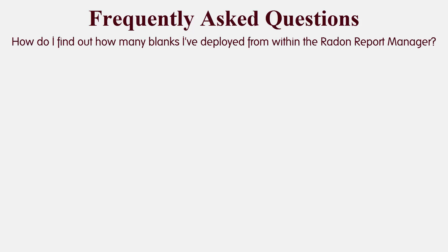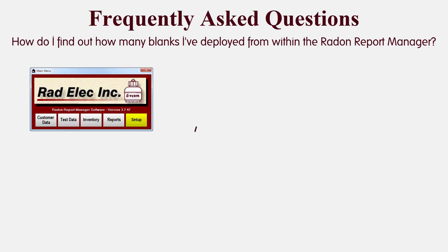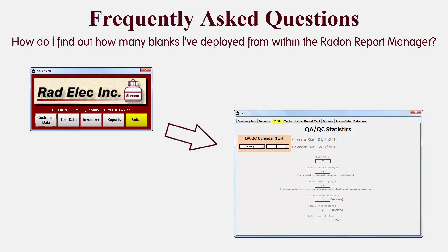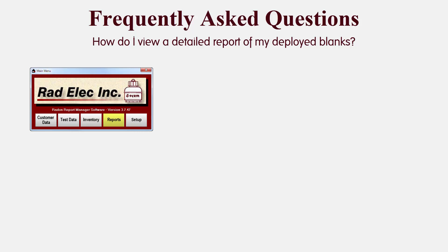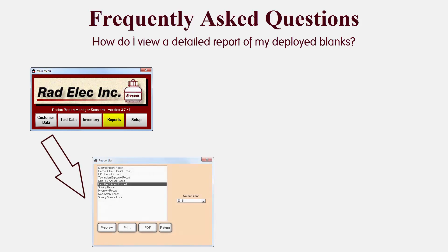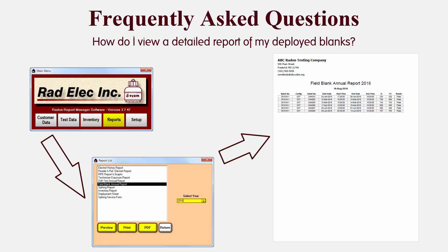How do I find out how many blanks I've deployed from within the Radon Report Manager? To see how many blanks you've deployed, go to the main menu and click on the Setup button. Click on the QAQC tab and you'll be able to see how many blanks you've performed, in addition to spikes, duplicates, and total detectors deployed. For a detailed report of deployed blanks, click on the Reports button from the main menu, select Field Blank Annual Report from the list box, select the appropriate year in the drop-down box, and then preview, print, or create a PDF of the resulting report.